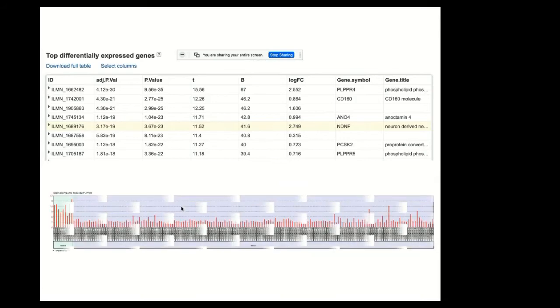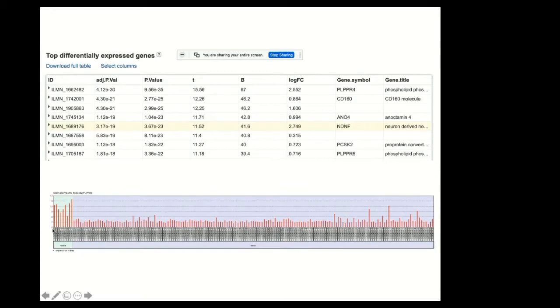And if you click on any of these probes, you get this sort of basic visualization showing the expression level of each of the samples, which are then color-coded based on the group, which is normal versus tumor.